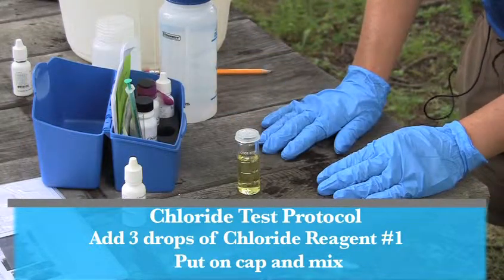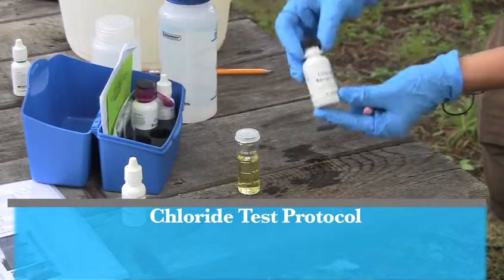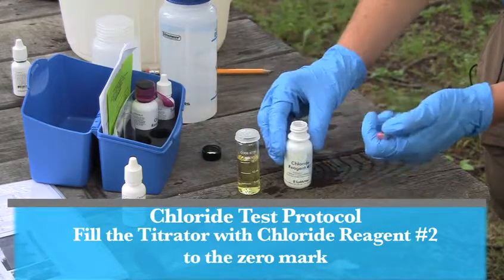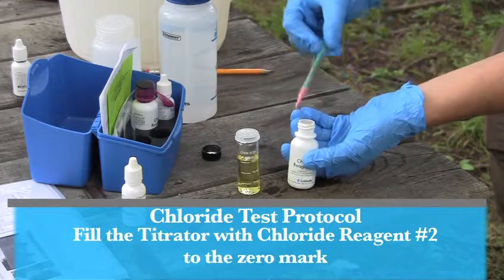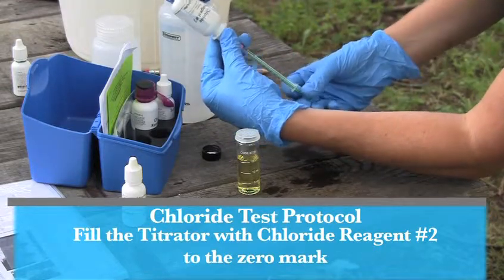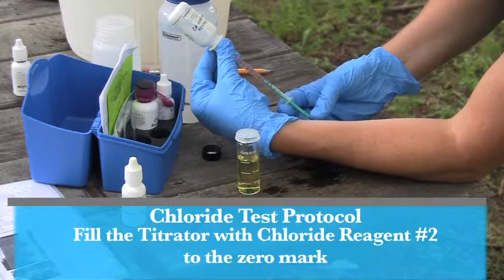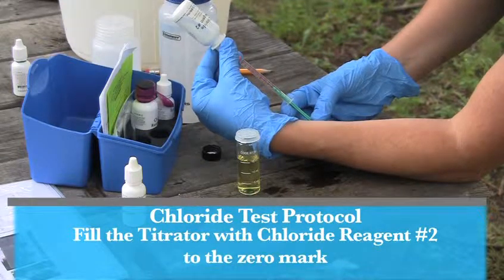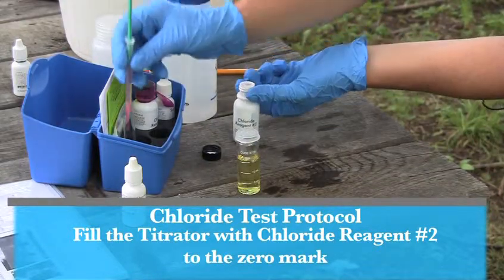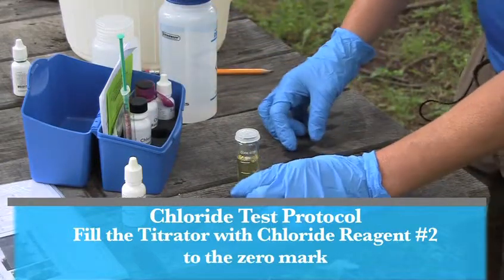You're now ready to get the titrator prepared to do the direct read titration for the chloride kit. For the titrator, you're going to use chloride reagent number two. Fill the titrator to the zero mark, making sure there are no air bubbles in the titrator — this is very important so that you get an accurate reading. The flattest and widest part of the titrator should be at the zero mark. Put the titrator in the sleeve and cap your titration solution so that it stays fresh for next time.